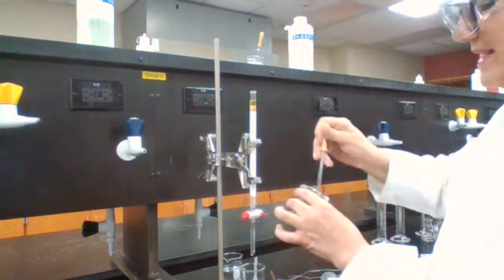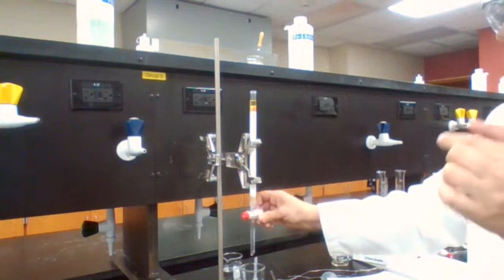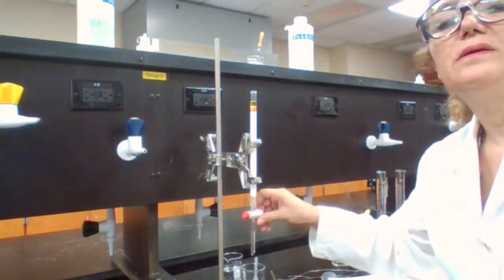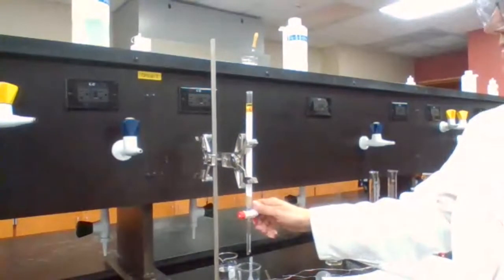Okay, I have my sample already. And I need to apply the solution, okay? Draw off to below the sand, perfect.